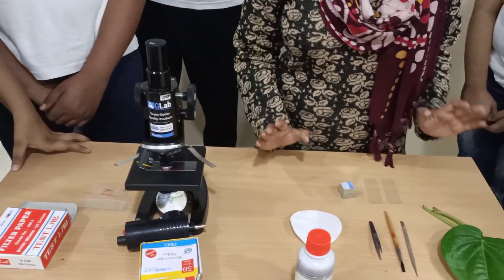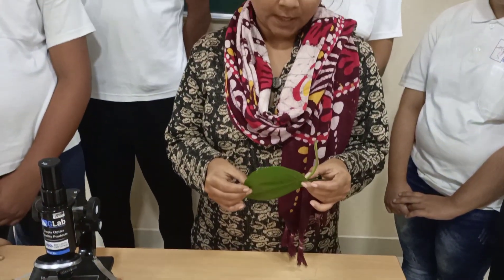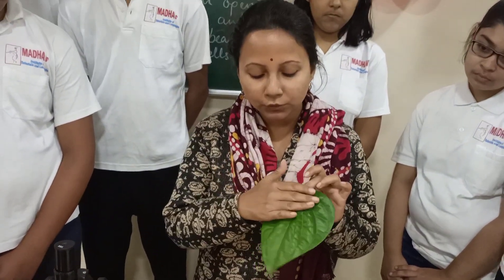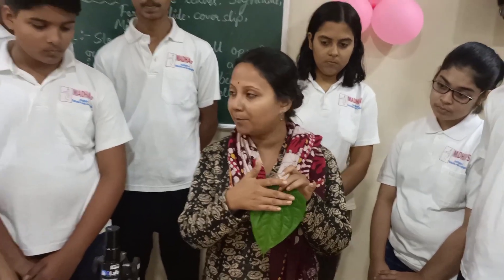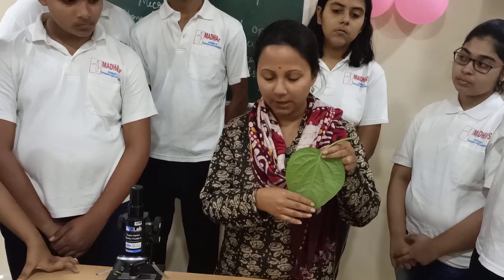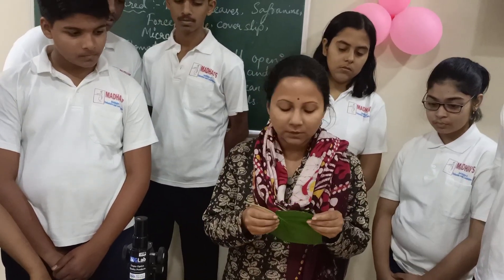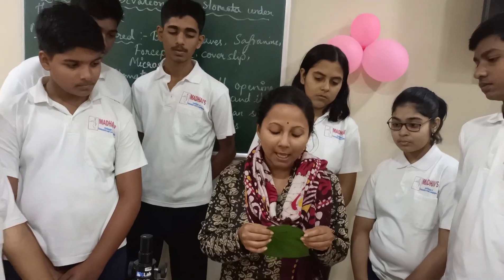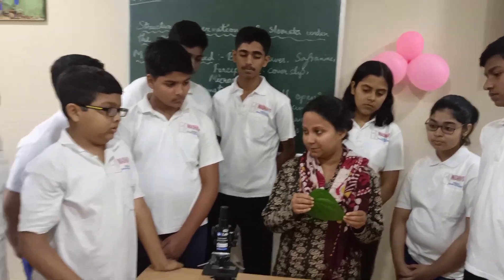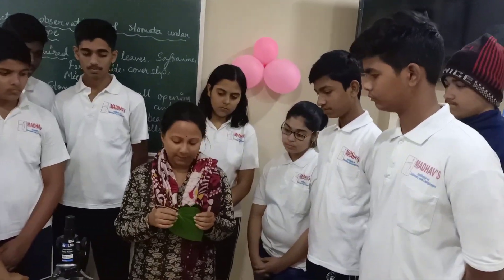Now I will start with the process. This is the bitter leaf — this smooth portion is the upper surface and this is the lower surface. We have to tear it in such a way that we can get the epidermal layer of the leaf, because the stomatal cells are present on the epidermal part of the leaf.